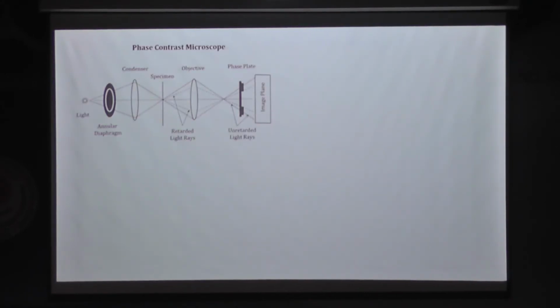That is how microscopy is based on. First thing, the specimen has to be stained for bright field. For the second thing, for polarization, it has to be crystalline in structure. The third thing is phase contrast.